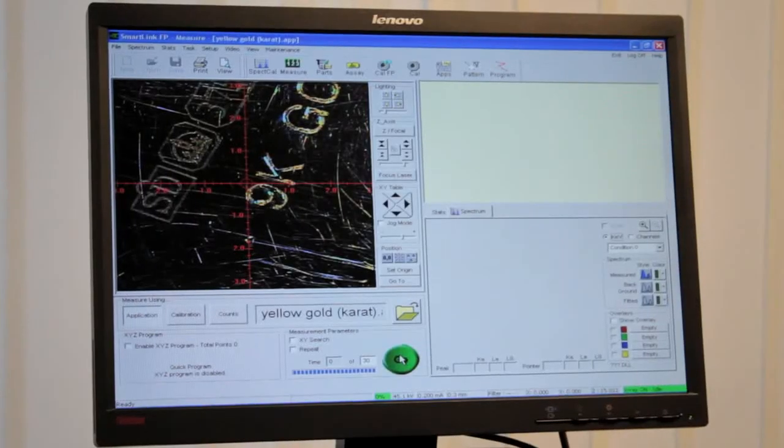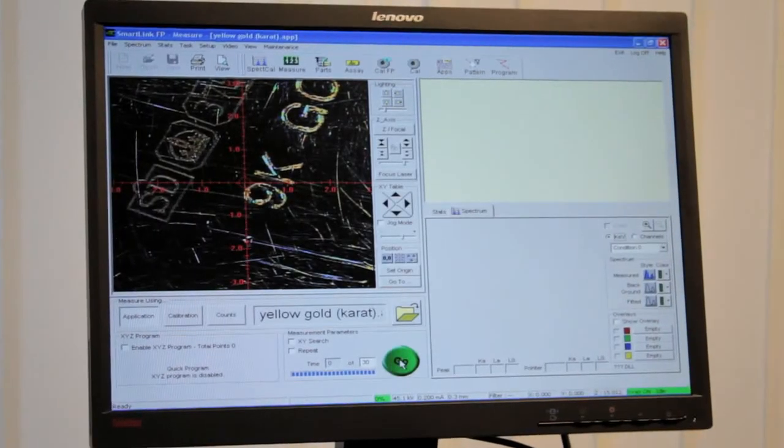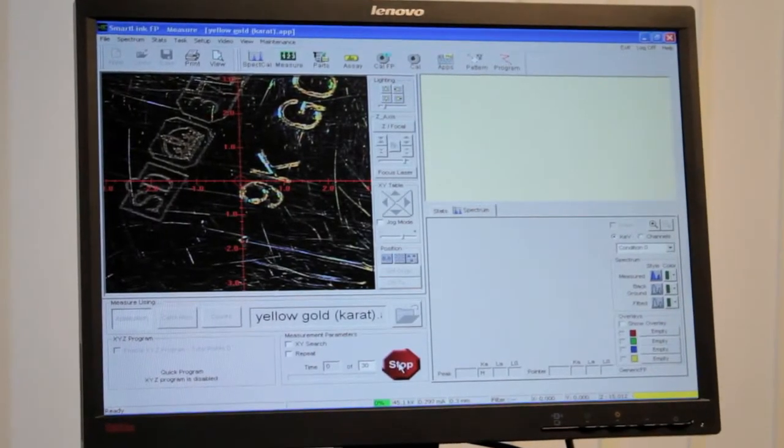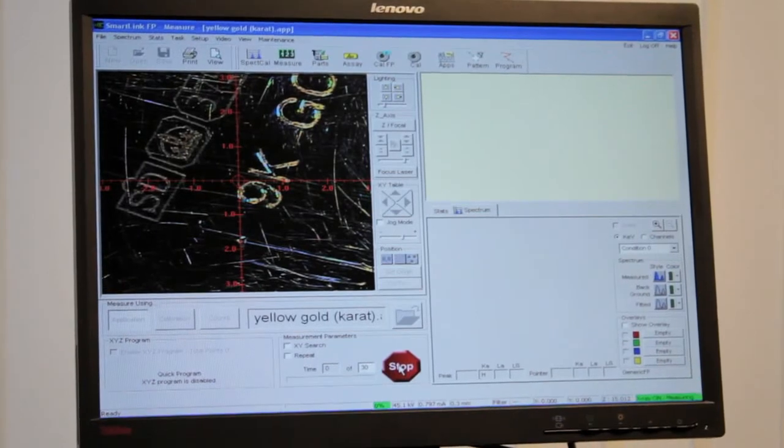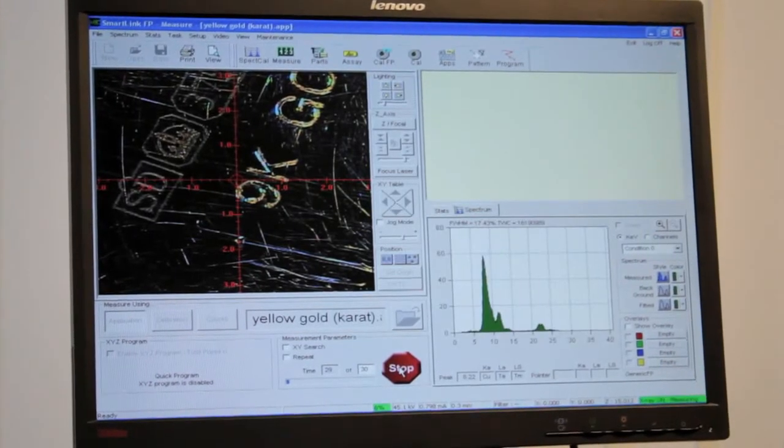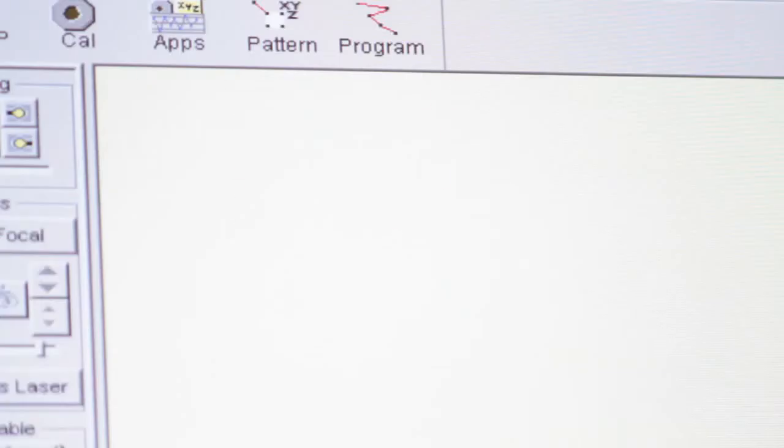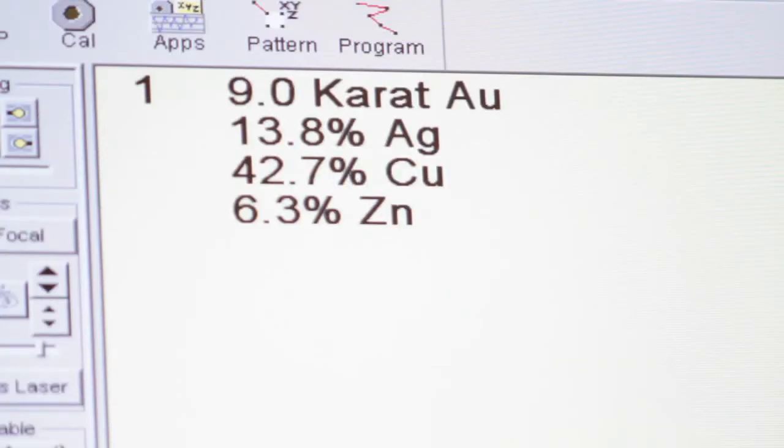The operator focuses the images and presses go to begin the analysis. Results are displayed clearly within seconds and can be printed or saved.